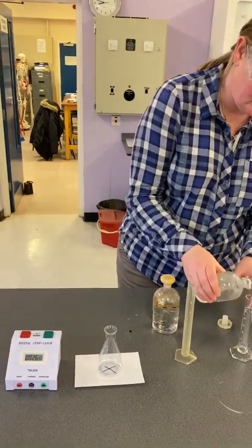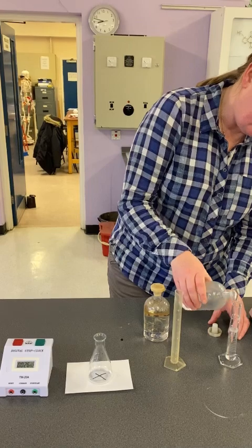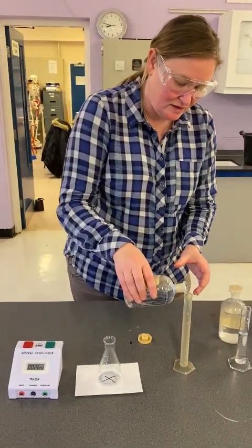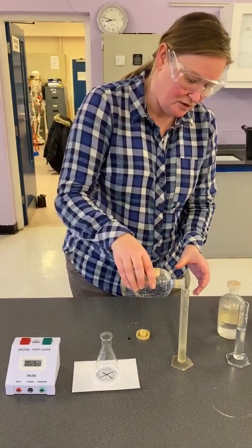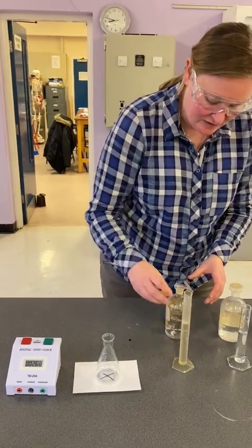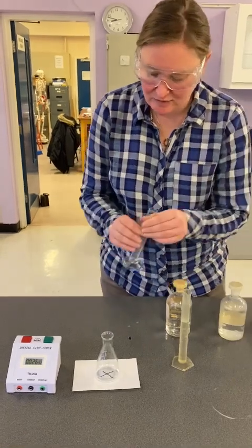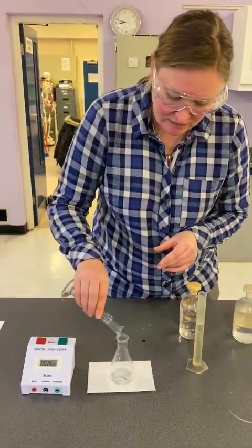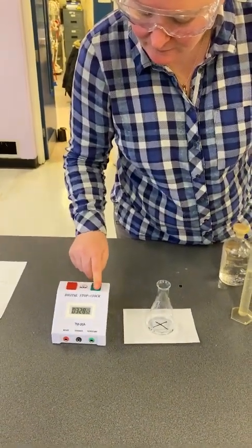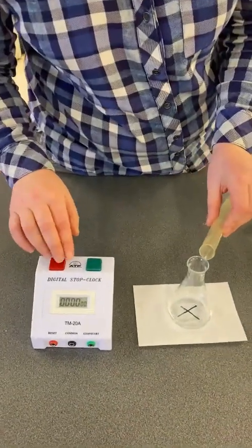So in the glass measuring cylinder, 30 degrees Celsius and 20 centimetre cubed. This is my acid, 20 centimetre cubed. A new conical flask. Sodium thiosulfate in first. I'm going to reset my time. And I'm going to add 3, 2, 1.